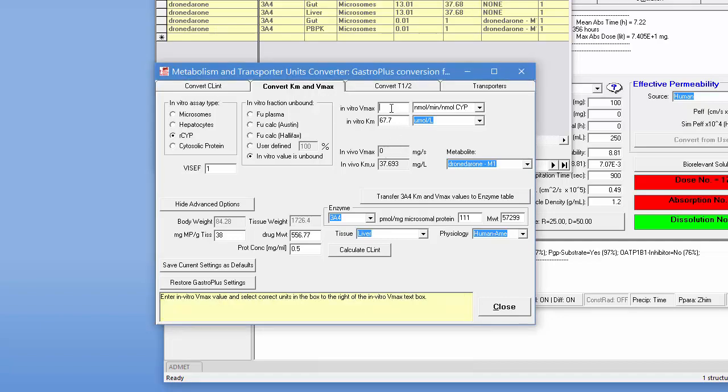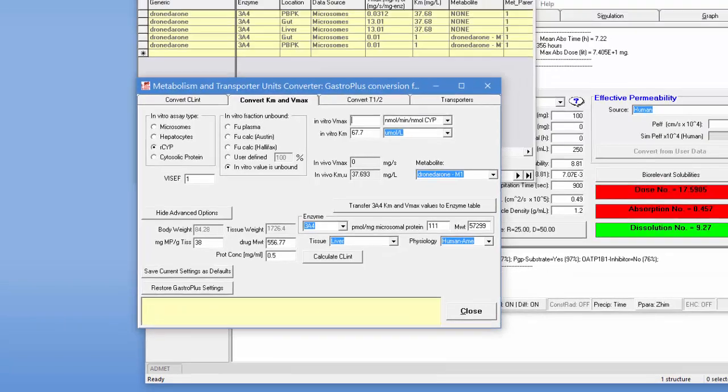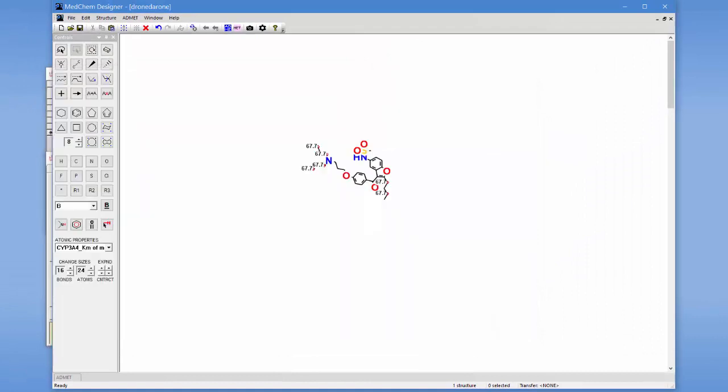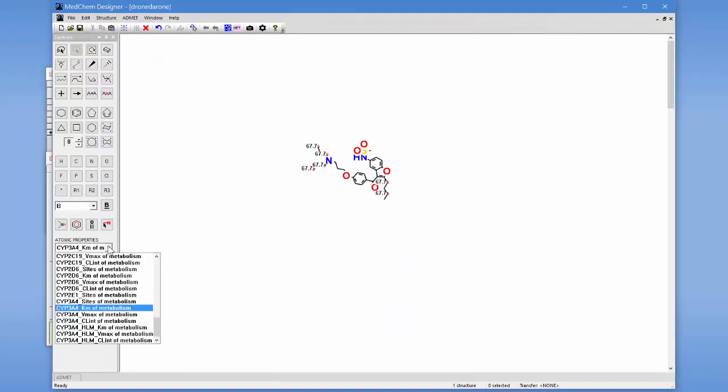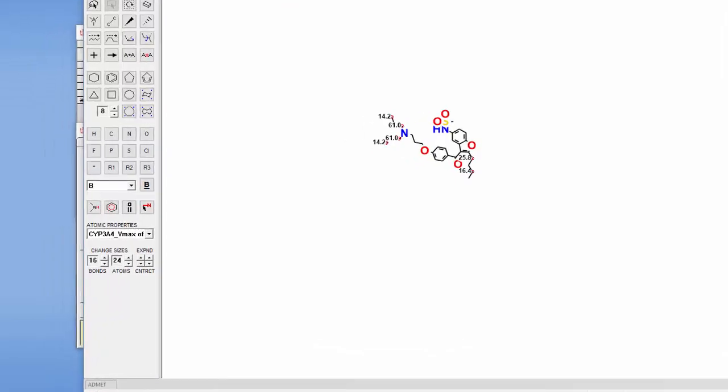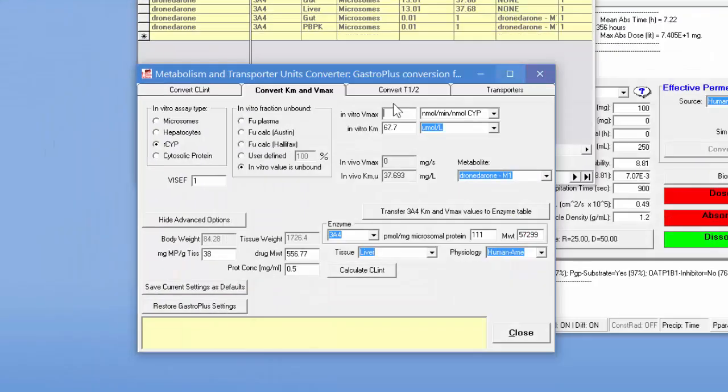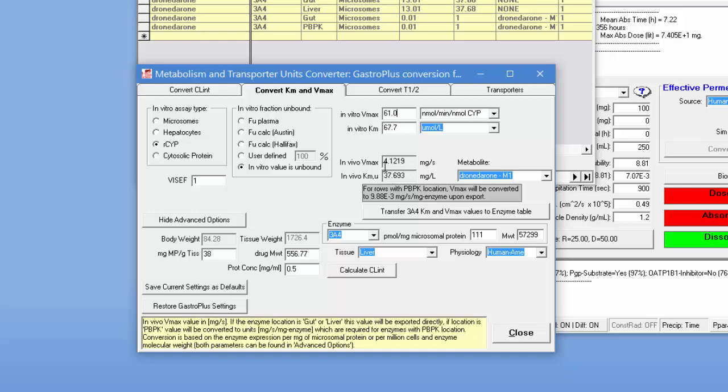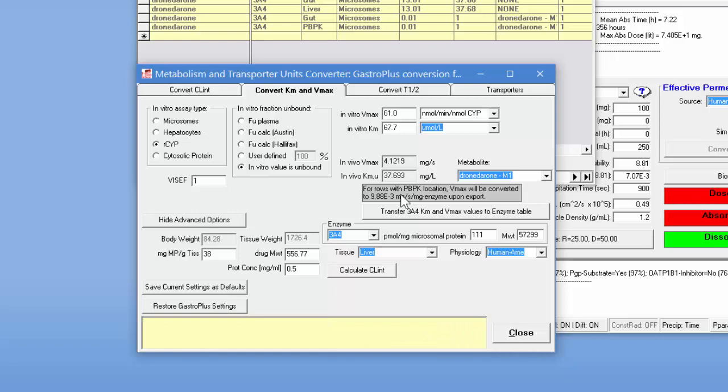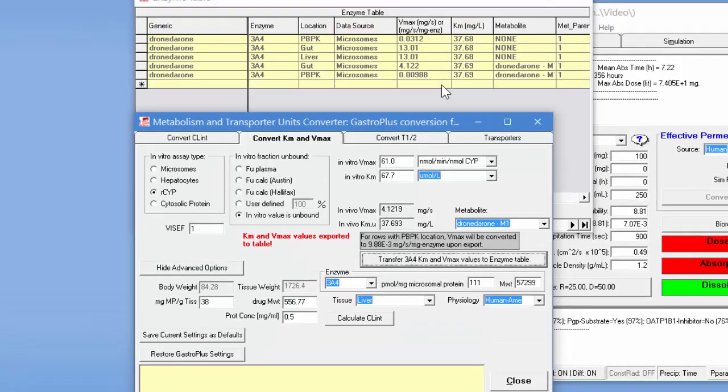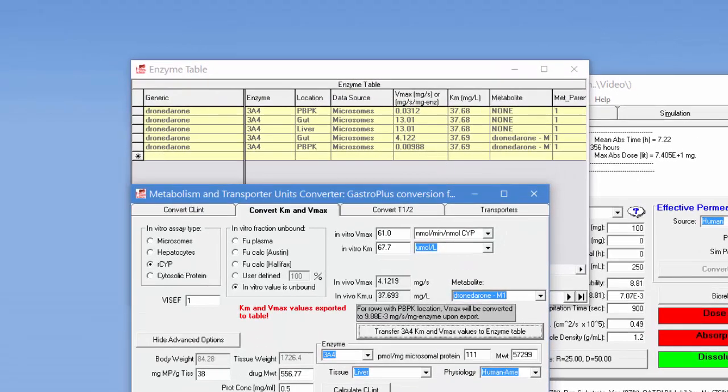Then for the Vmax value, we want to again go back into MedChem Designer and we want to display the Vmax values here. And for this particular site, it's 61. So we need to type in 61.0 here. And that'll generate this number for the gut and then this for the PBPK location. And then we can simply transfer these to these values here.